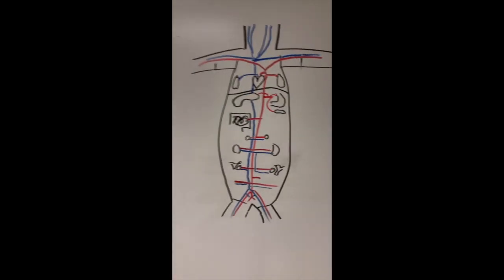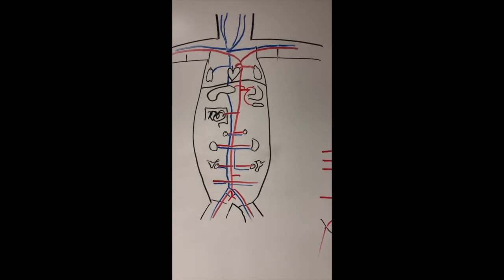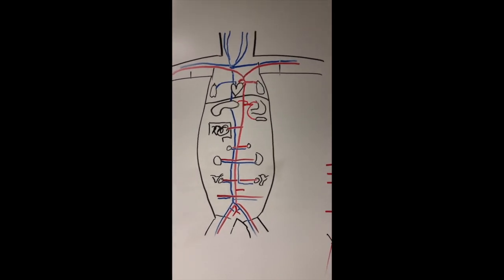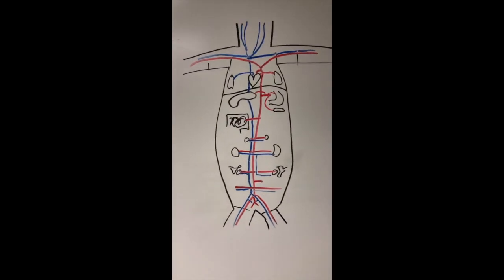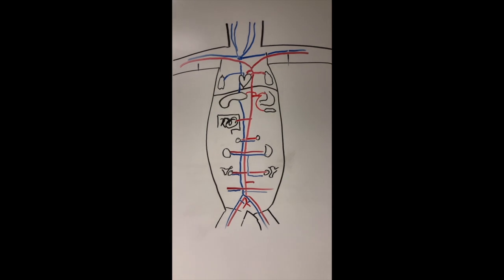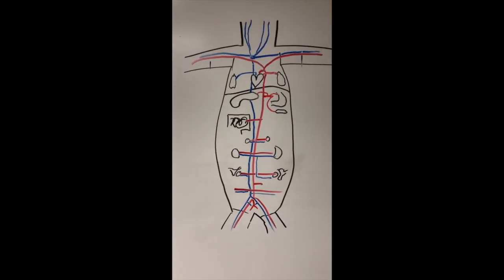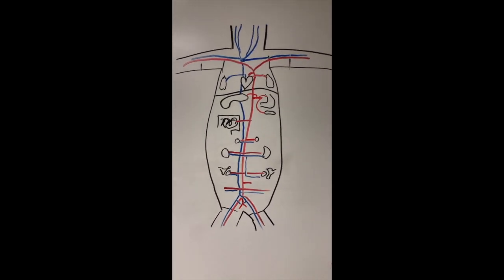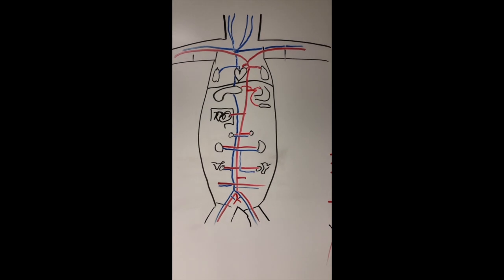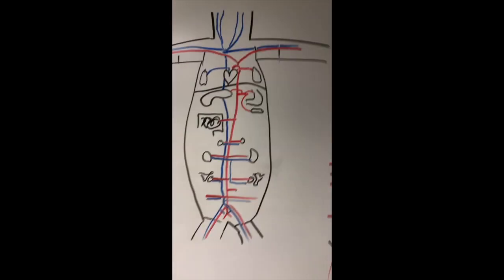So back here, we have a number of organs, and it really is mostly the organs of digestion that say, hey, we just brought in some new inventory. We don't want to put it directly into circulation. We might want to detoxify it first or package it up or do some other things. So before it heads back to the heart for distribution around the body, it stops by the liver, which does most of the detoxification and modifications and other things. So yeah, that's the portal vein system.